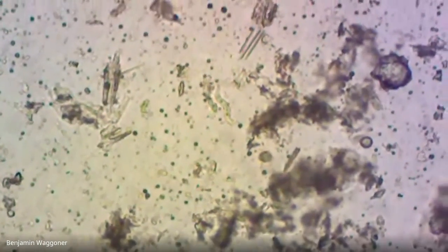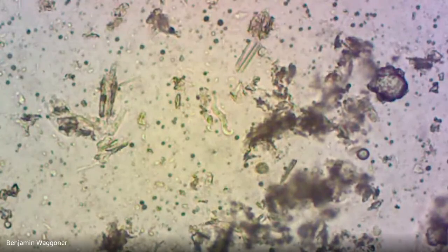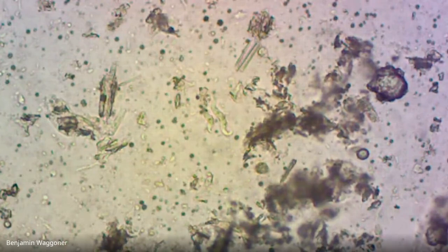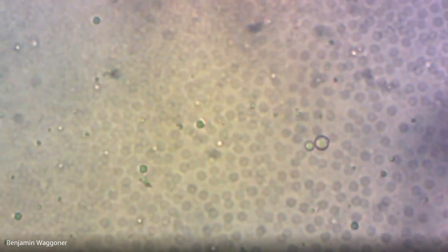In the termites that I used to look at, I used to do a lab that looked specifically at termite flora. And in the species that we usually looked at, if you saw an elongated symbiont like this, kind of spindle-shaped, it was likely to be in the genus Streptomastix. Now, since this is not a species I'm familiar with and it's been a long time, I don't absolutely know that that's what it is. But if you called it that, I certainly wouldn't mark you wrong. Where's the? Here we go. Yeah, there's a pair of them.